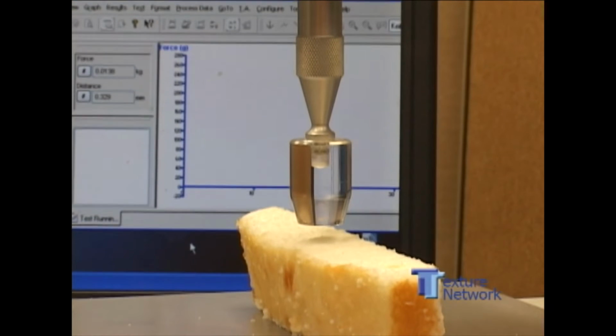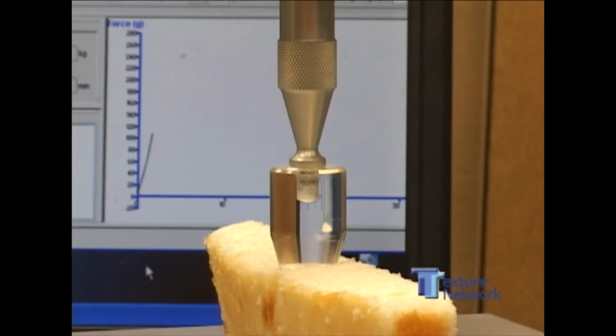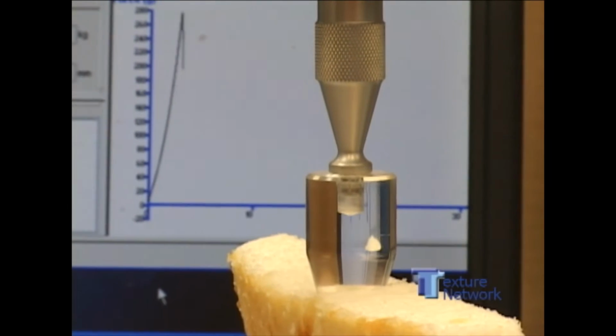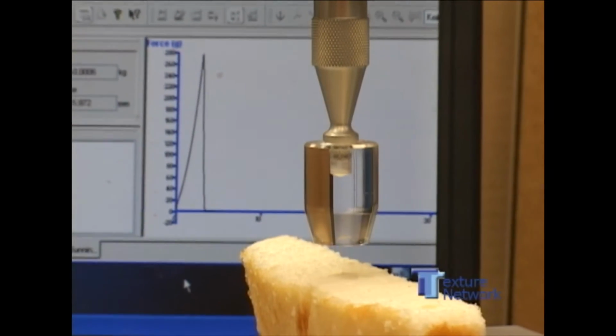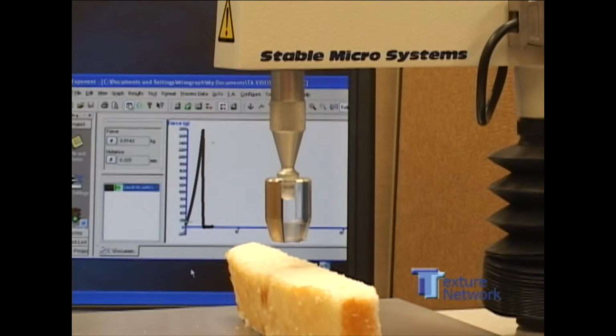And why are you testing these cakes? These cakes contain an additive that we are evaluating for an ingredient supplier. First, we evaluated how the ingredient affected the viscosity of the batter and the volume and crumb grain of the cakes. Now we are seeing if it has any effect on the firmness. Very interesting. Thank you, Amanda.